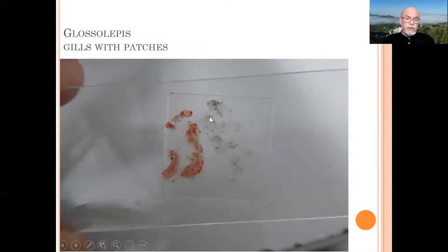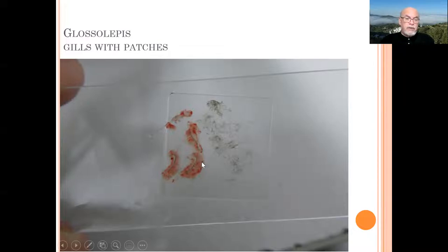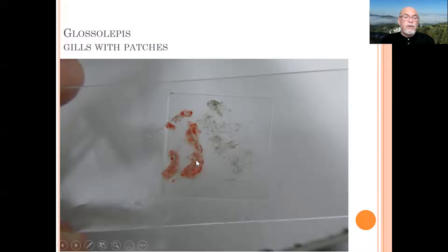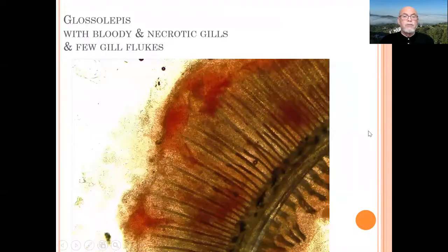Already on the gills, which I show here in a microscopic observation, you can see that the gills are patched — some red patches and some clear transparent patches. It should be a homogeneous orange-red color. This is not normal colored gills. That is our microscopic pathological view.